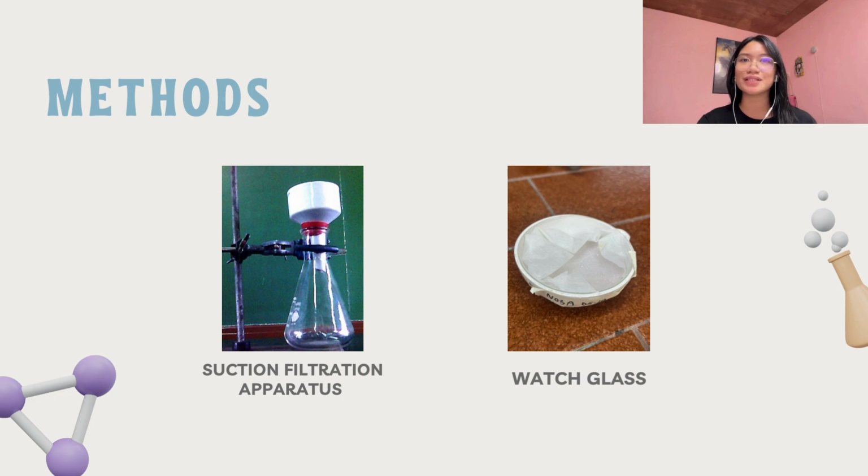When the suction filtration apparatus has been set up, moisten the paper in the funnel with a few drops of the solvent. Now, filter the crystals out of the solution by pouring it in the funnel. When the crystals are almost dry, release the vacuum by disconnecting the tube from the suction flask and wash the crystals with 5 to 10 ml of cold solvent and use a stirring rod for half a minute. Reconnect the tube to dry the crystals. To dry the crystals, the group transferred the crystals together with the filter paper into a watch glass, covered it with another filter paper and kept it in the locker until the next laboratory period.